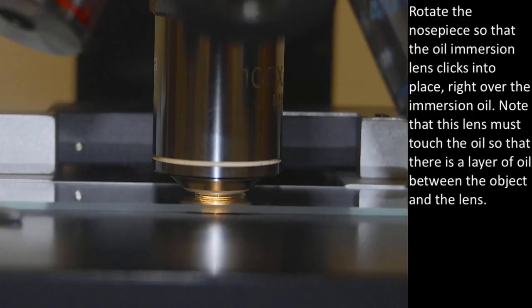Rotate the nose piece so that the oil immersion lens clicks into place right over the immersion oil. Note that this lens must touch the oil so that there is a layer of oil between the object and the lens.